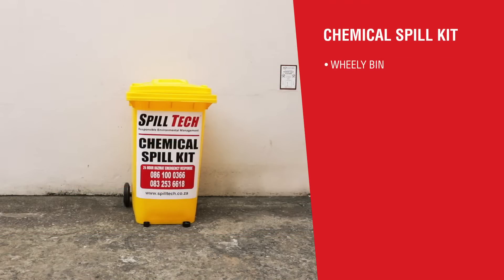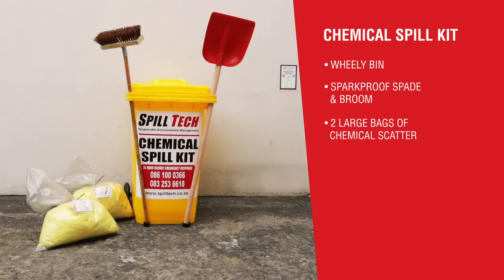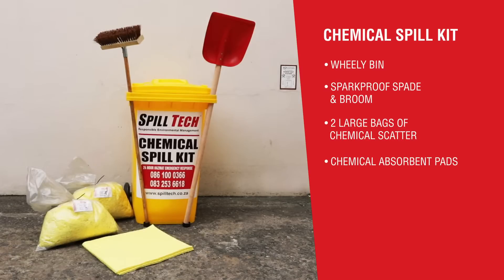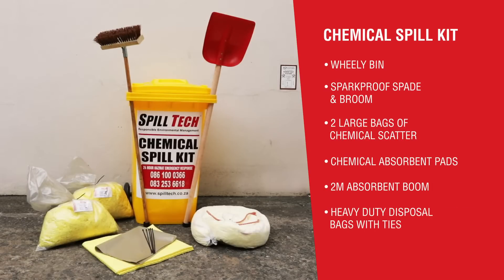The Spilltech 240-litre Chemical Spill Kit typically comprises a wheelie bin, a spark-proof spade and broom, two large bags of chemical scatter, chemical absorbent pads, a 2-metre absorbent boom, heavy-duty disposable bags with ties, personal protective equipment, PVC gloves, goggles and dust mask.